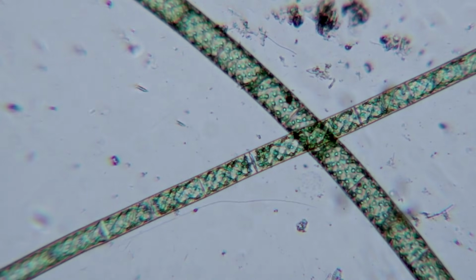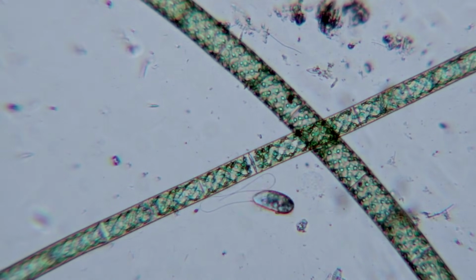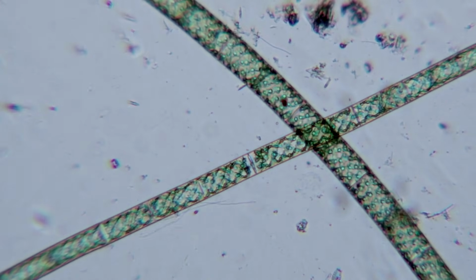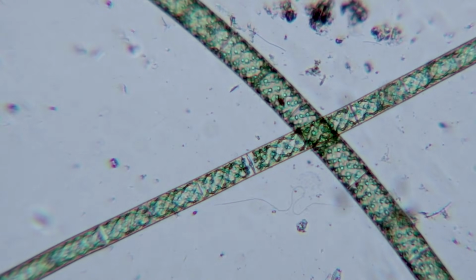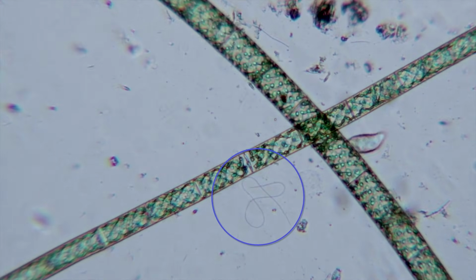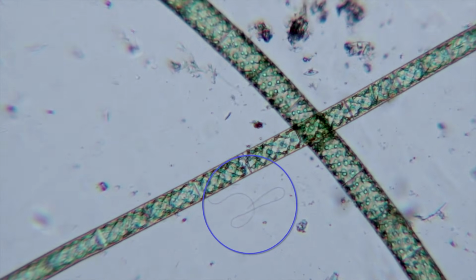This shot is actually a time lapse, and if I slow it down just for a moment, you can see that relative to Paramecium, the algae does not move at all. Likewise, the movement of this filamentous bacteria is also only visible under time lapse.